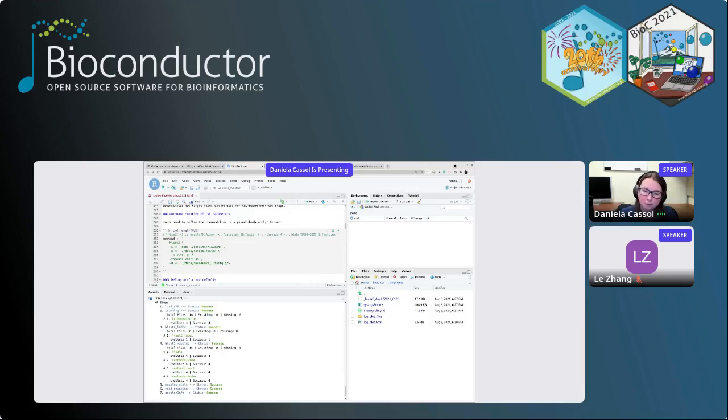So here, because I just showed HiSat2 and mapping, I bring the class one simple command from HiSat2, which has HiSat2 as the base command, the output, which is the SAM file, the reference genome, and the input file here. The way you need to provide that is you just provide this command line in this special bash script format.